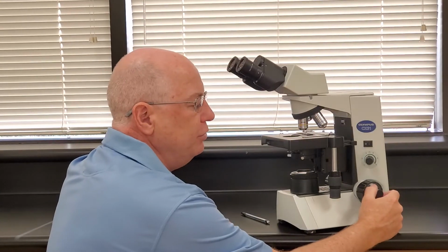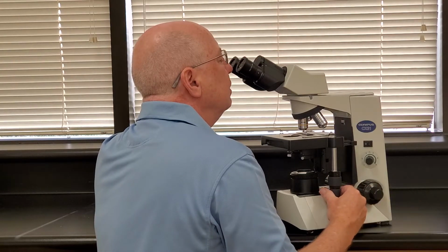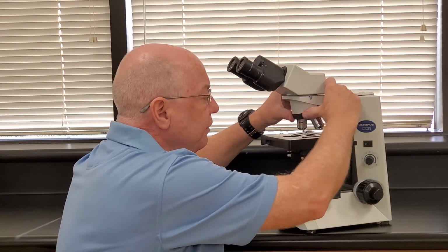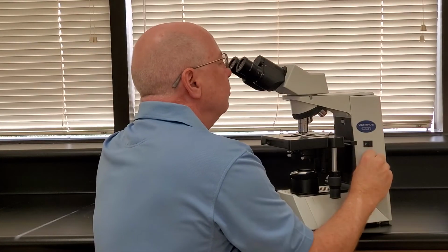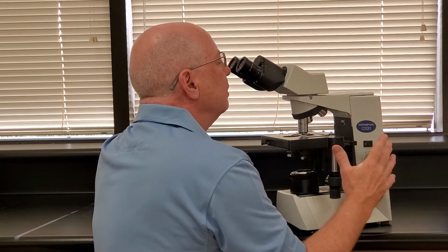You should only use the fine focusing knob to make very fine adjustments and wiggle it, maybe turn the light up. You're always going to be turning knobs and moving things, and you make your observations. If you need to go to the high magnification, you do so. You adjust your light a little bit, you move your slide in fine focus, and you make your observations, do your drawings, whatever you need to do for a lab report.